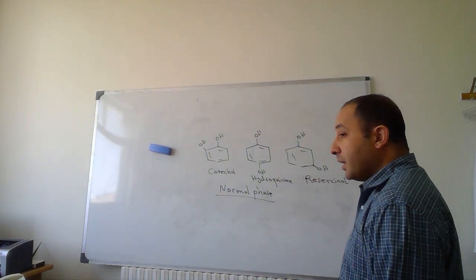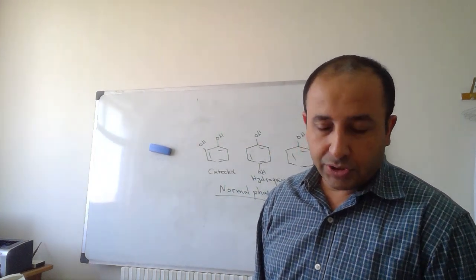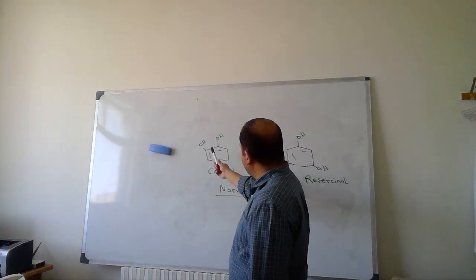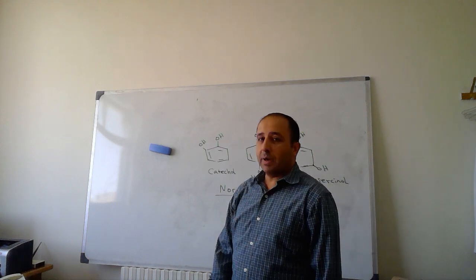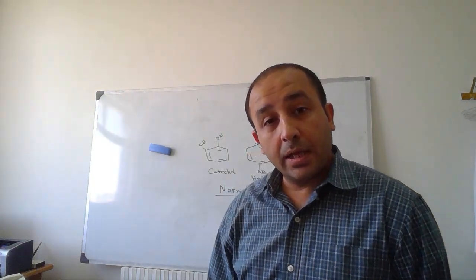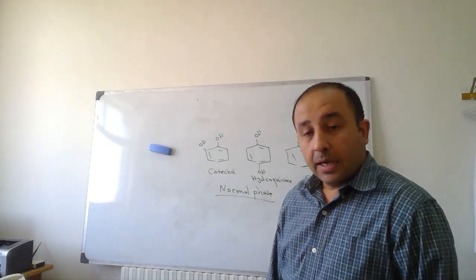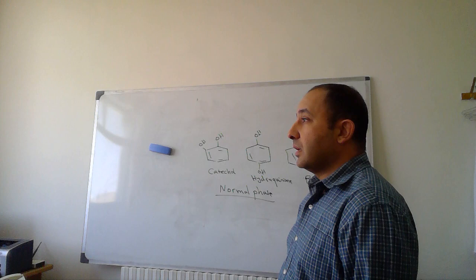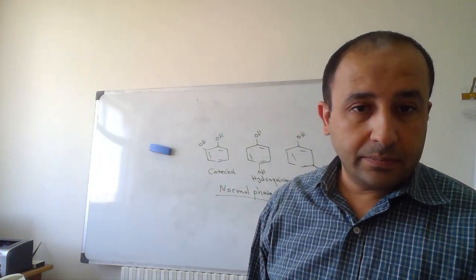You might think of cation exchange. Do we have cationic capability in these compounds? Can these compounds bear cations? Obviously, this is impossible. We can also think of anion exchange. Can these functionalities carry anionic ions? Yes, they can.